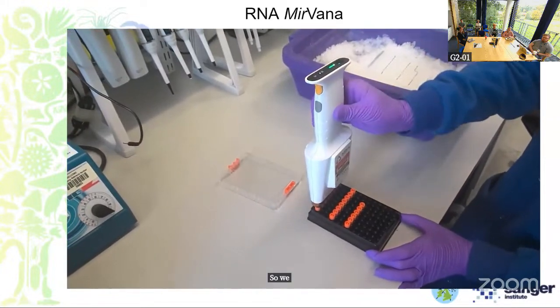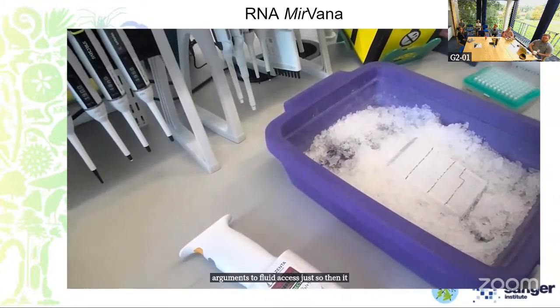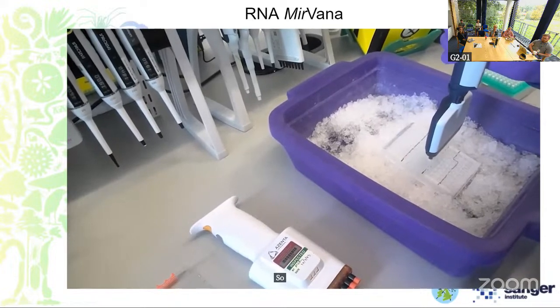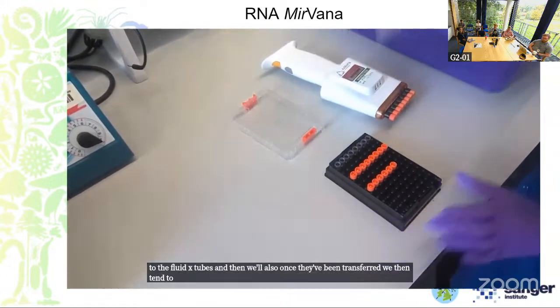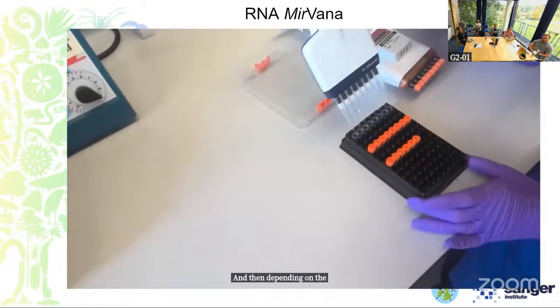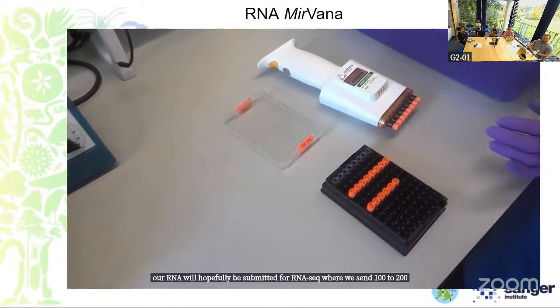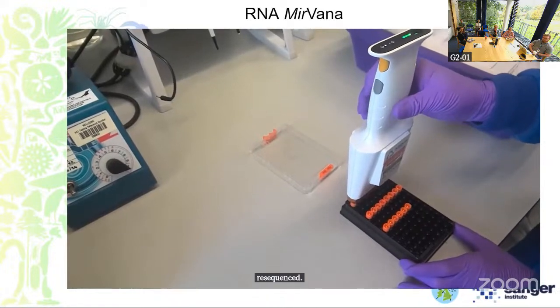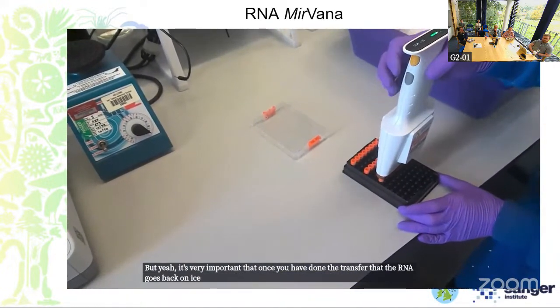So we pop that on ice, and then we'll transfer the eluates to FluidXs, just so then it's easier for storage and also knowing which sample is which. So we just transfer those to the FluidX tubes, and then once they've been transferred, we tend to do some QC. So we'll do Qubit and NanoDrop for our RNA. And then depending on the QC, our RNA will hopefully be submitted for RNA-seq, where we send 100 to 200 nanograms to be sequenced. But yeah, it's very important that once you have done the transfer, the RNA goes back on ice, again, just so there's no degradation.